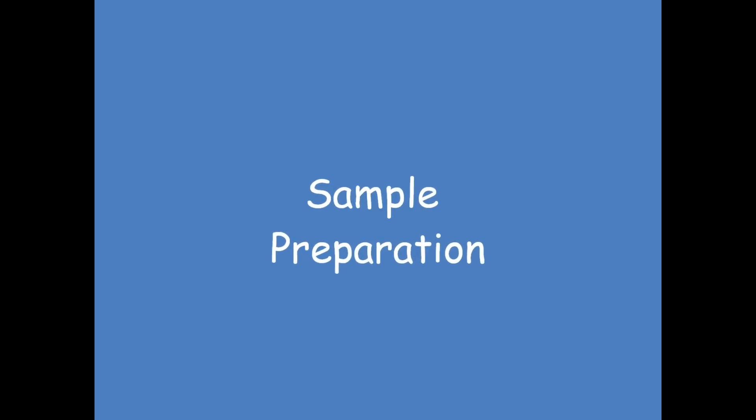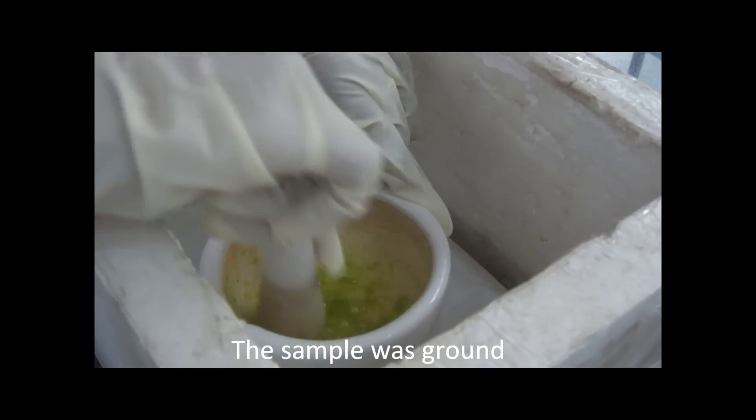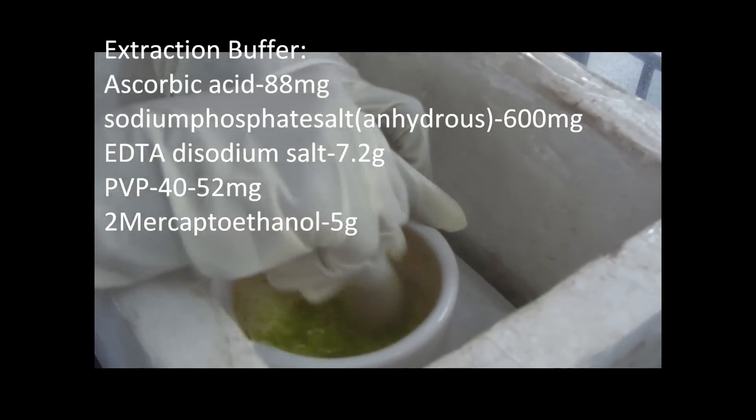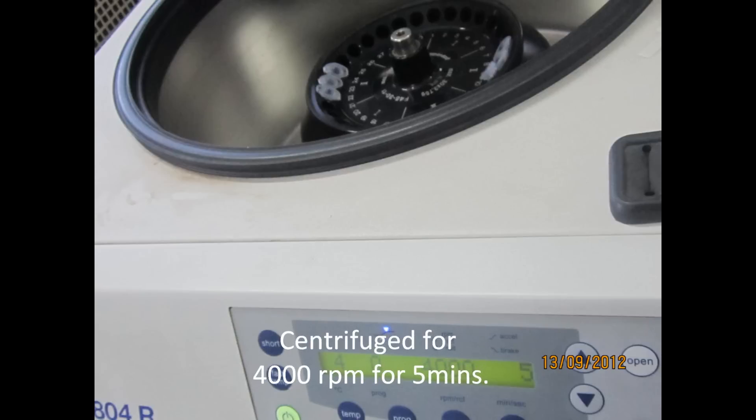Sample preparation: the sample taken was maize leaves, from which Zein protein was extracted. 0.4 grams of sample was ground with 1 ml of extraction buffer, then centrifuged at 4000 rpm for 5 minutes.